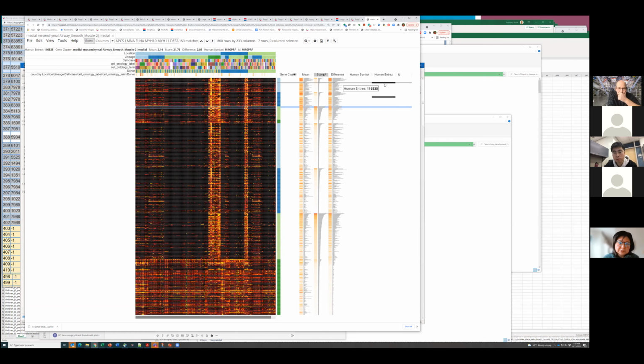Yeah. So, for example, if you choose the severity or the response to the steroid treatment, it will be a different ranking. Absolutely. Yes. So our first level ranking is just based on, whatever the name of this module is, compared to its comparison group. So in this case, airway smooth muscle subclass 2 as compared to medial lung cells.